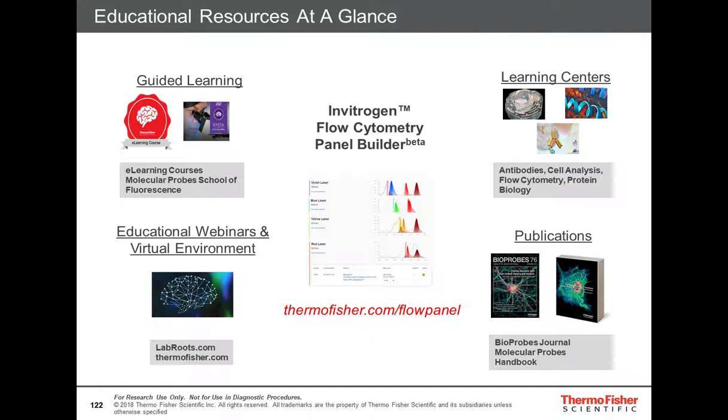There are methods that are published by the group in Mario Roederer's lab. So if you want to take a deep dive, certainly Simon Monard did some talks on this and has published this as well, MONARD. So there's a lot of data out there, but I think my personal favorite is the Peak 2 method. The antibody capture bead method is good as well. It just takes a little bit more number crunching.